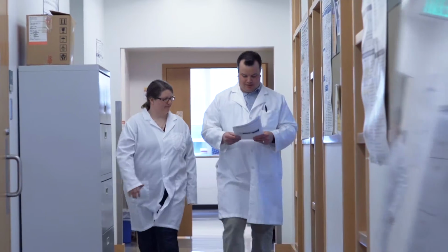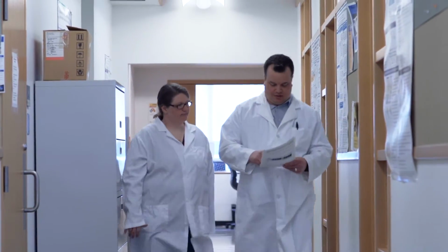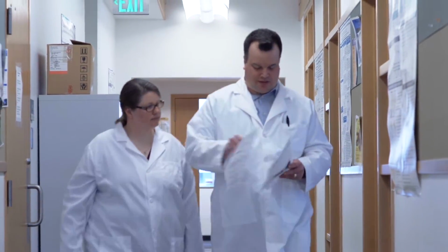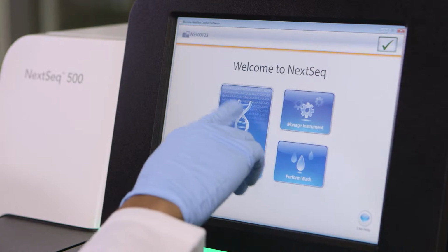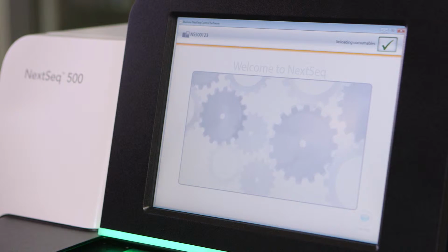Over the last few years, we've really been moving towards RNA-seq, and not just simple things like mRNA-seq where we can look at expression. We do things like total RNA-seq or certain types of pull-downs like RIP-seq, or even things like looking at small RNA or 16S profiling in bacteria in the host to try to pull out more than just the gene expression. Having both the NextSeq and the MiSeq in the lab is very advantageous.